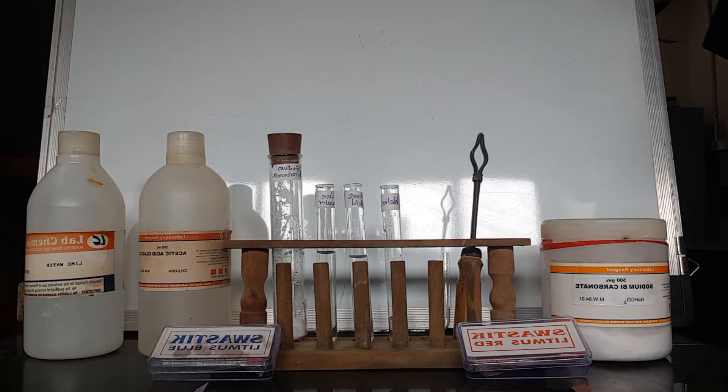Assalamu alaikum and good morning students. We are doing today our practical number 8 to study the physical and the chemical properties of acetic acid.